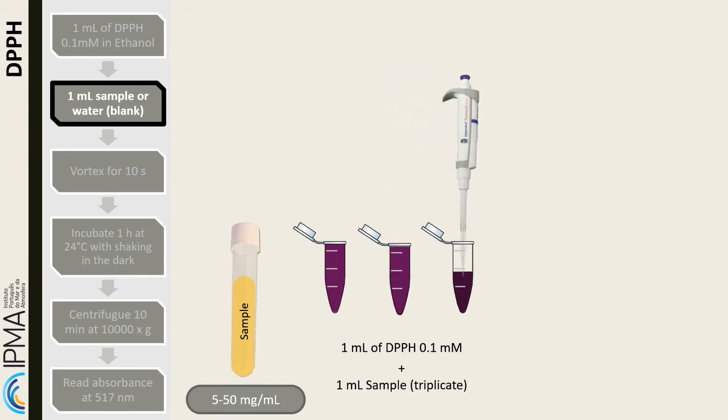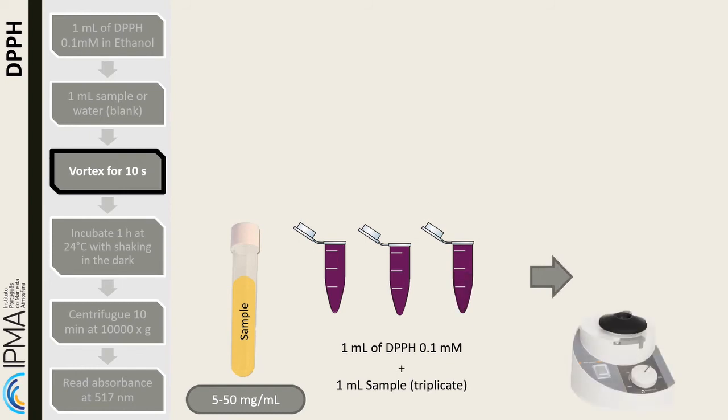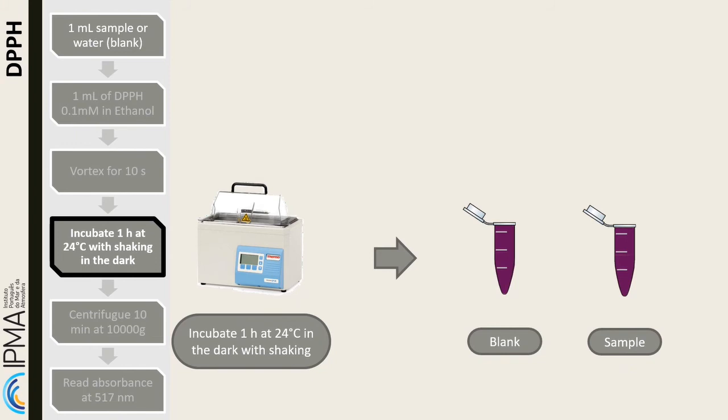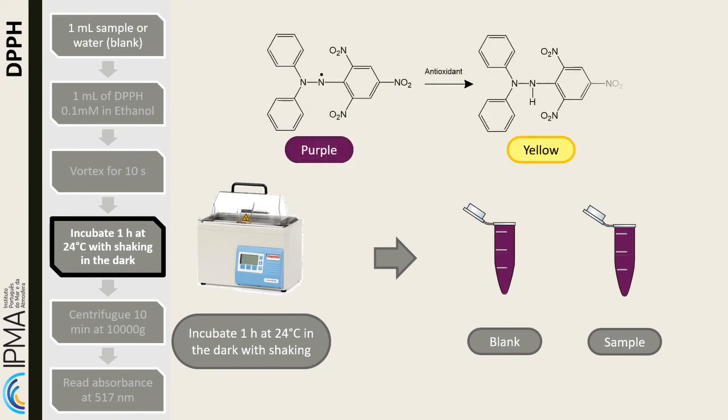Homogenize in the vortex, then incubate for 1 hour at 24 degrees Celsius. During the incubation time, the DPPH is reduced and changes color from purple to yellow due to radical scavenging.